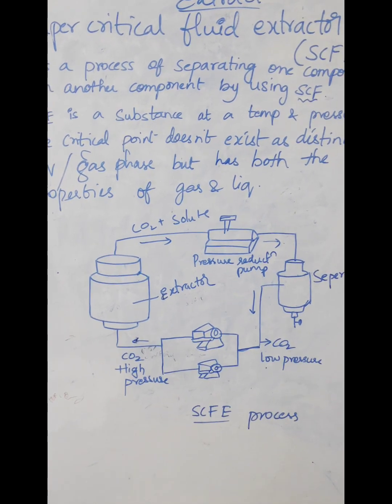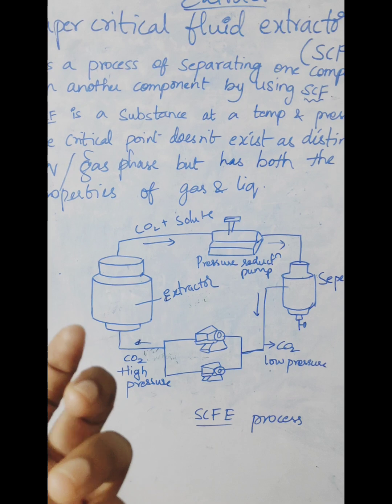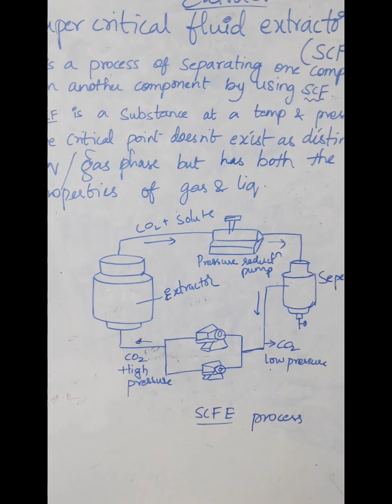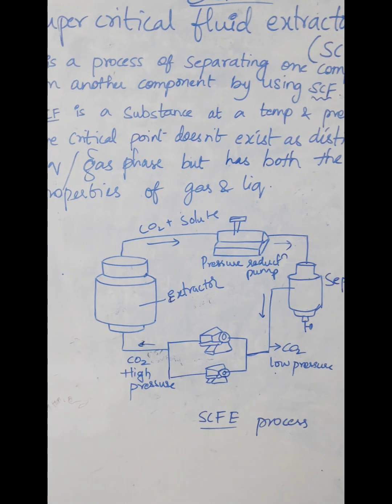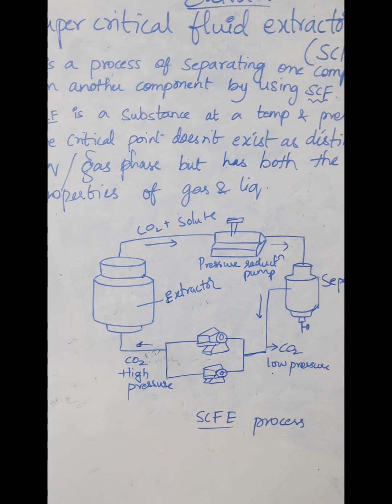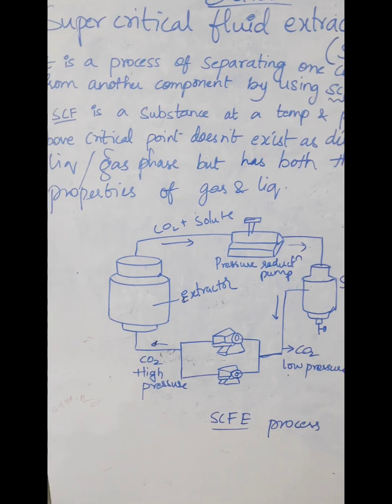Now let us understand what is SCF. So SCF is a fluid or substance at a temperature and pressure above the critical point. I guess in pharmaceutical engineering you have heard about the critical point, right?